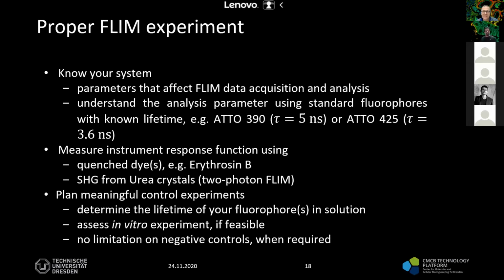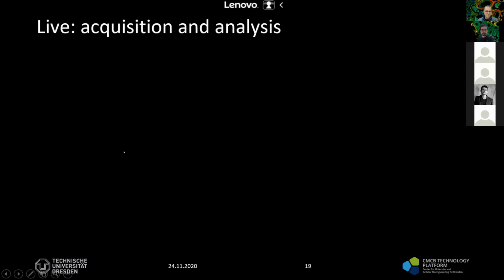Okay, good. And so what I have done extra, so not today, it's not going to be live, is that we have measured the instrument response function of our system, and also measured the lifetime of NADH in solution in phosphate buffer. And then I have recorded the videos. I'm going to show you the videos and talk over them. And if you have any question, I would be happy to address them. So let's go to the next.